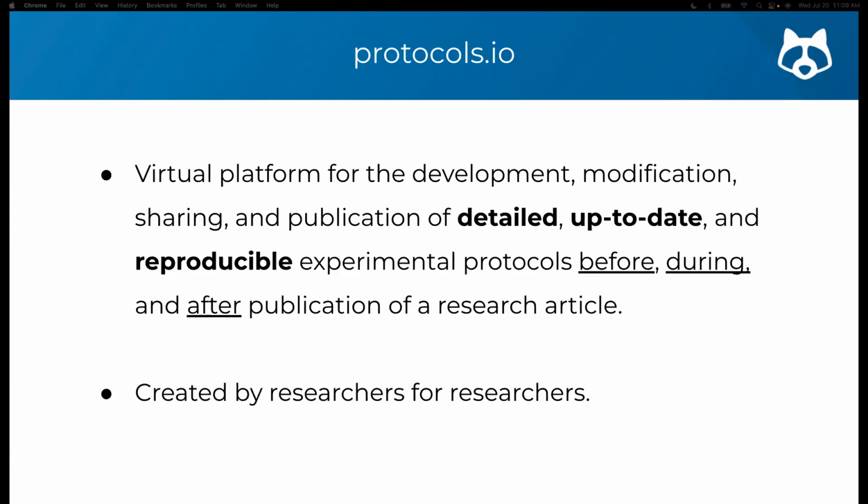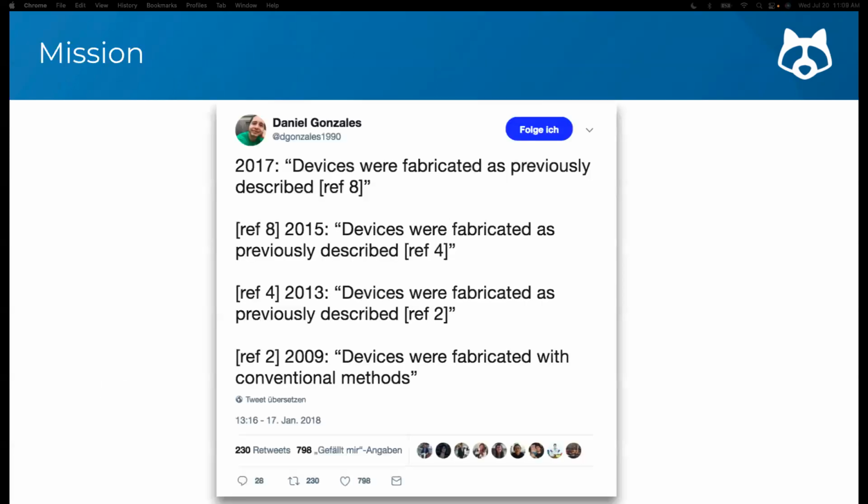Protocols.io was created by researchers for researchers. We have collected a series of tweets that comment on the difficulties and frustrations of trying to replicate previously published experiments.